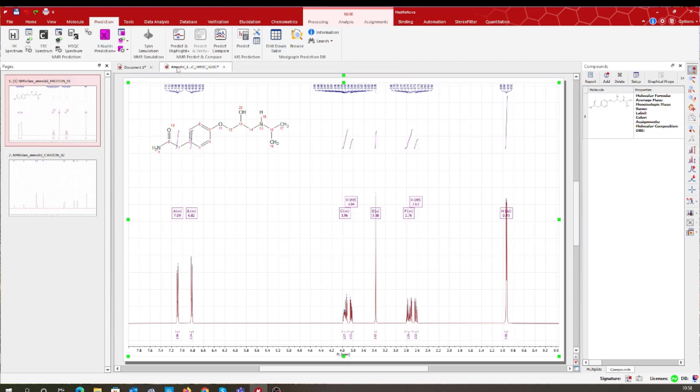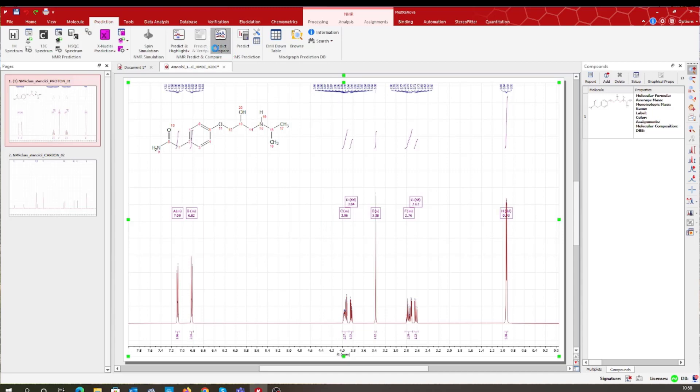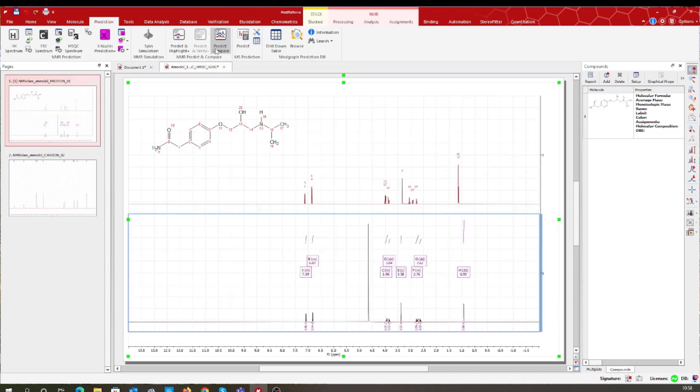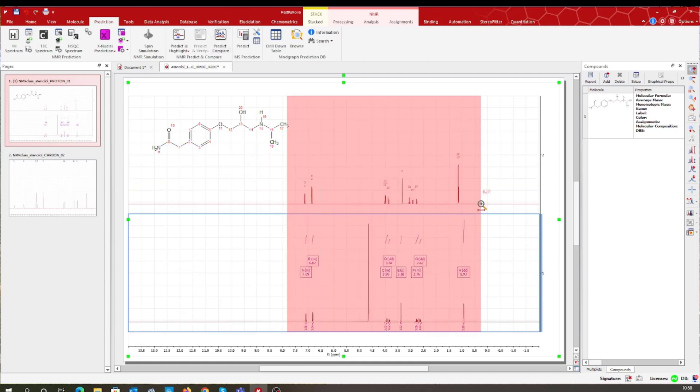In addition to that, using the predict and compare button, you will be able to directly compare this prediction data with your set of experimental NMRs.